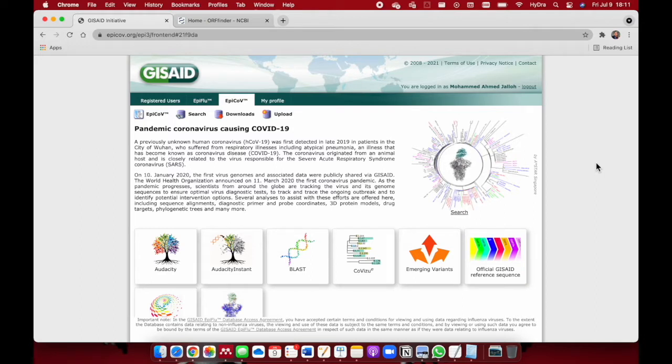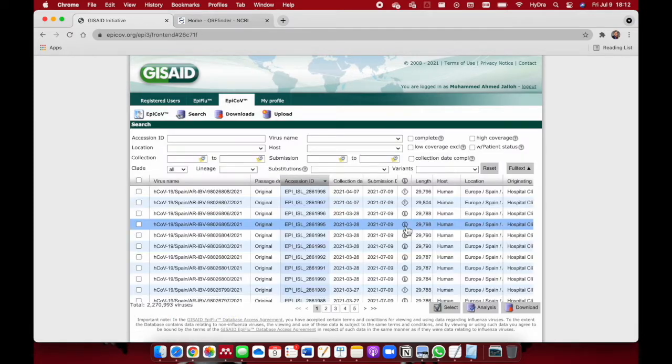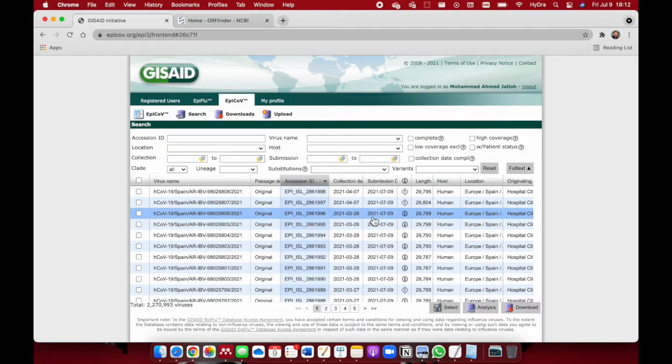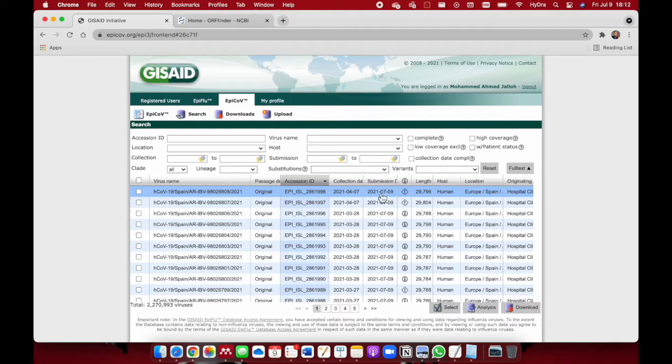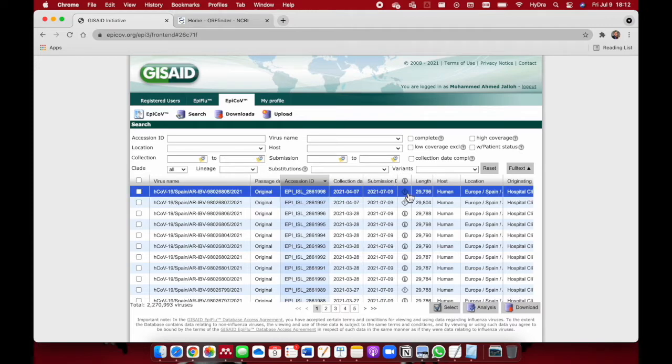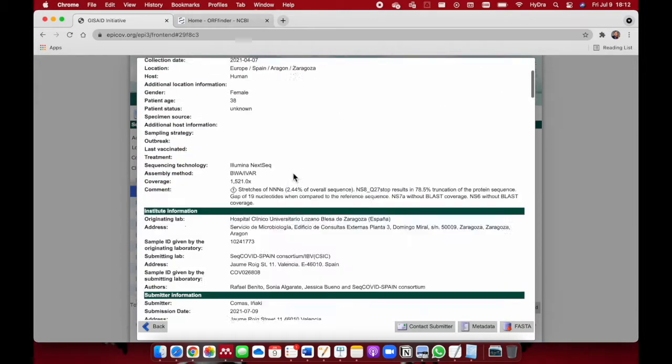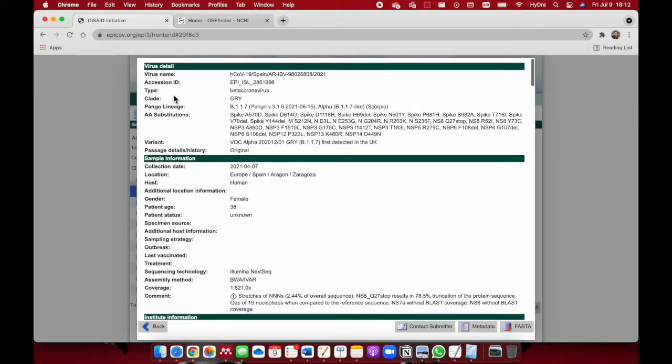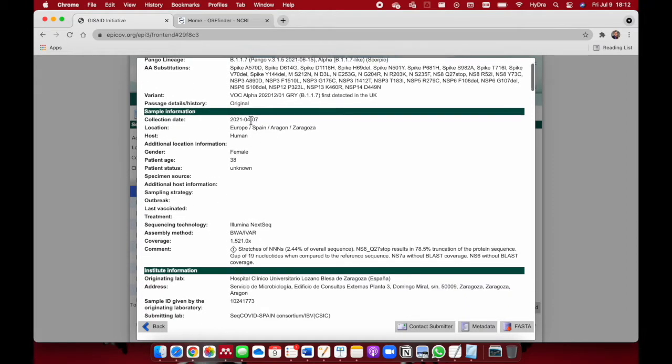The first thing we need to do is download our sequence from the GISAID website. We come to the search menu and click on it. Our example today will be based on the latest sequence that has been uploaded. We'll pick this one right here, uploaded July 9th, 2021. It's from the beta coronaviruses, B117 which is the alpha variant. This sequence is from Spain, Zaragoza.